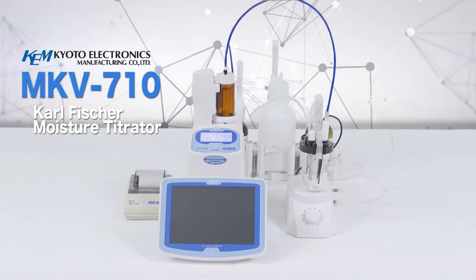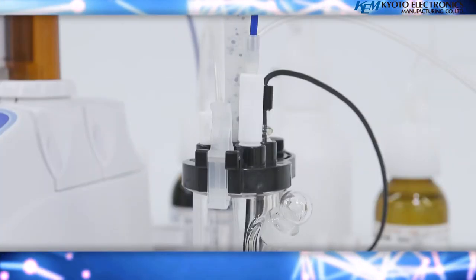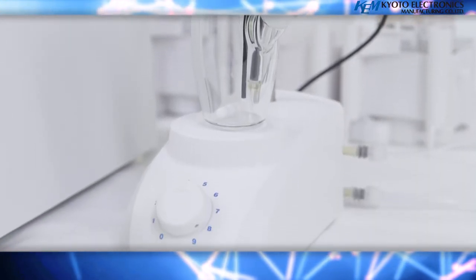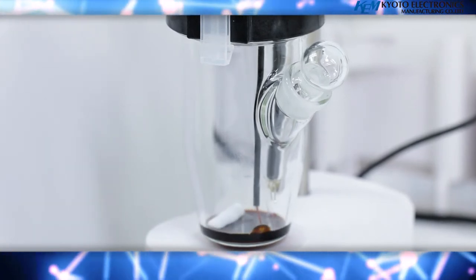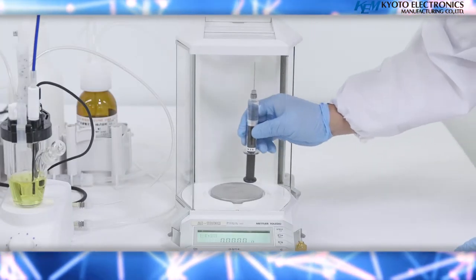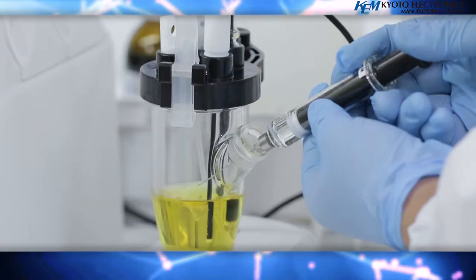Carl Fisher Moisture Titrator MKV-710. Carl Fisher titration is a widely used method for measuring the water content of various substances. This method is known for its reliability and is used to make analytical measurements by many official methods of analysis, such as ASTM, UOP, JIS, and Japanese Pharmacopeia, and so on.